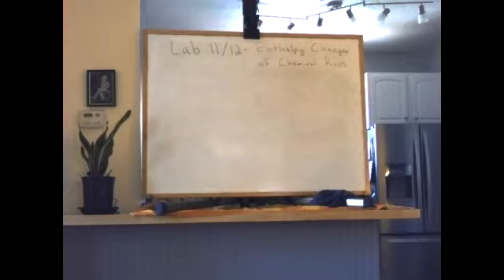Hey everyone, this is lab 12 in your lab manual, but technically it's the 11th lab we're doing. So I'm calling this lab 11/12. But anyway, it's the last lab of the semester. In this lab, we're looking at heats of reactions, so enthalpy changes of chemical reactions.